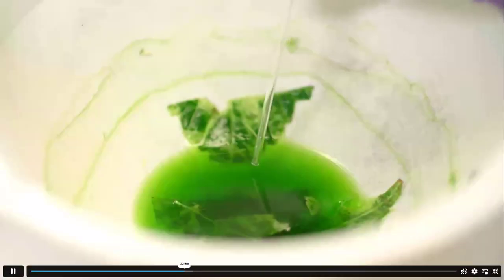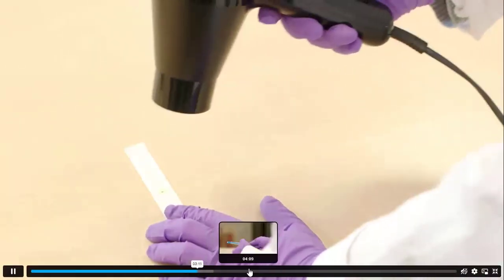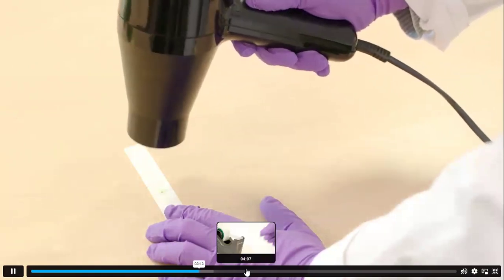Now they'll take a chromatography paper. This is the capillary tube. You may use a dropper and just put the green pigment over there 4 to 5 times. Then they dry it as well in between, but it's not compulsory that we dry it. I'm just trying to move it a little bit faster.